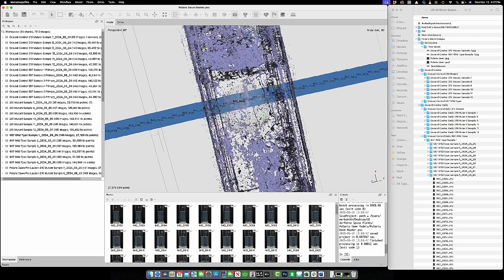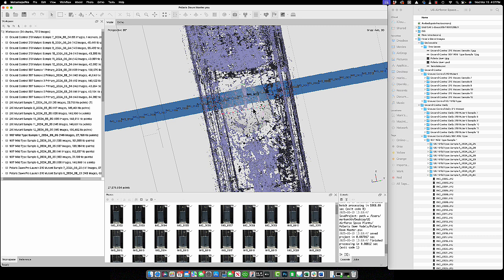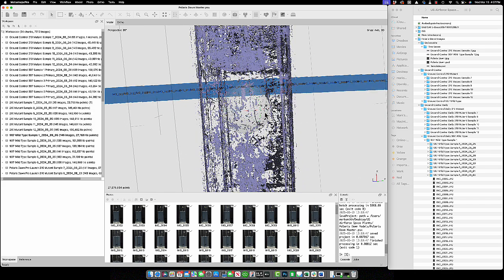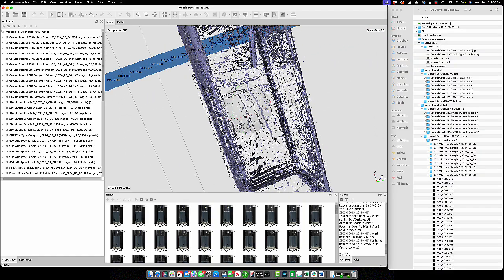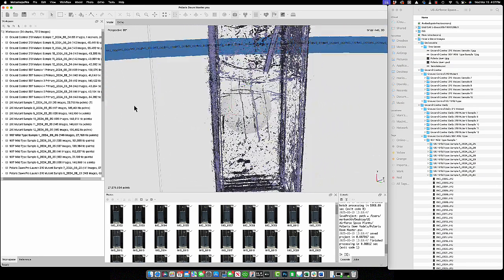But as the cuvette rotates 2 degrees, there's an optical shift because of optical refraction where the root is now repositioned. It's kind of like looking at a fish obliquely through the surface of water. It's actually a few degrees away from where you're viewing it. There's a couple of different methods for cleaning this up, but for the sake of just getting a point cloud finished and getting it to the client, all I've been doing is isolating the most prominent looking root structure, and ideally that's the one that's closest to that facet of the cuvette.